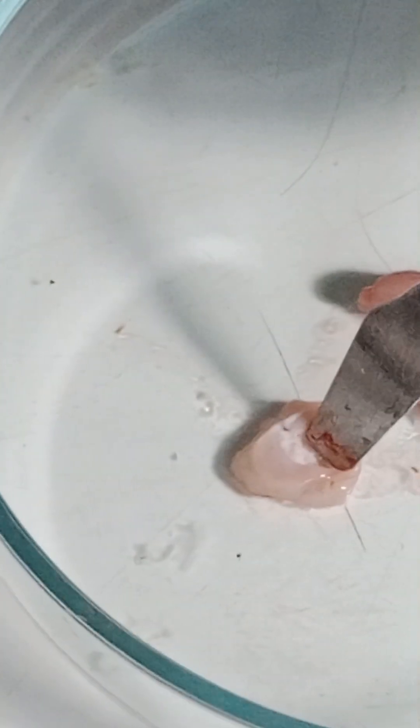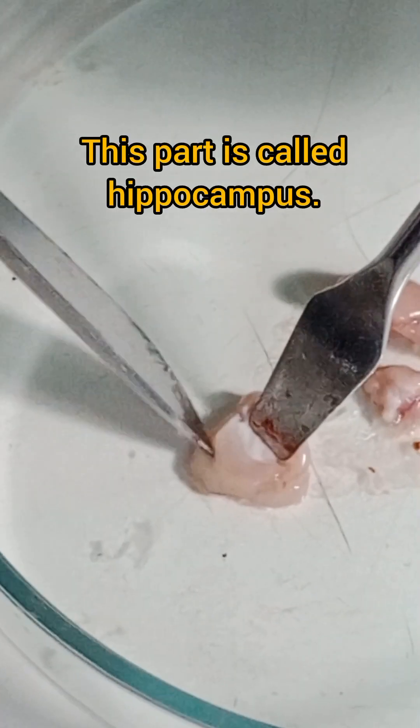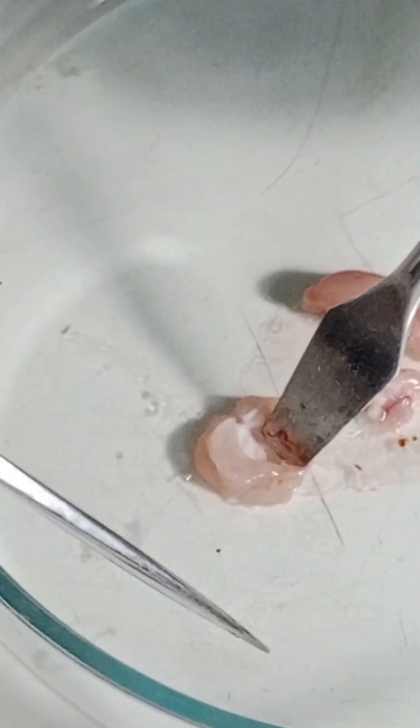If you try to remove any part randomly it will be a problem. Use one spatula and one blade. This part here is called the hippocampus — you can see it in the video — and this part will be removed nicely.